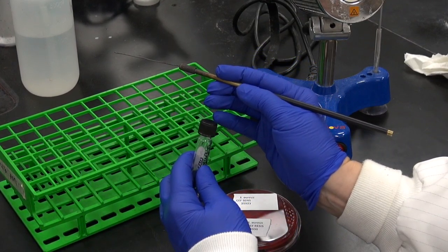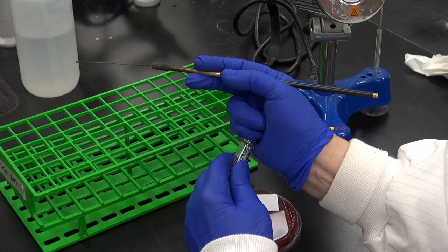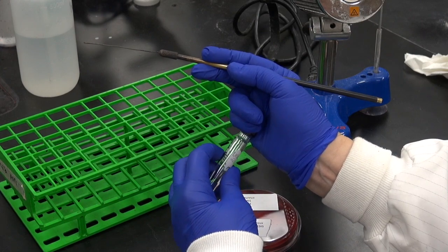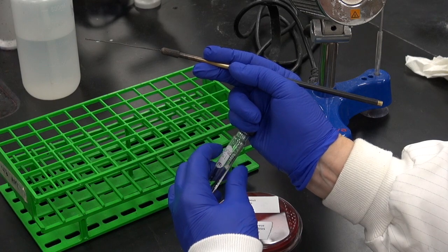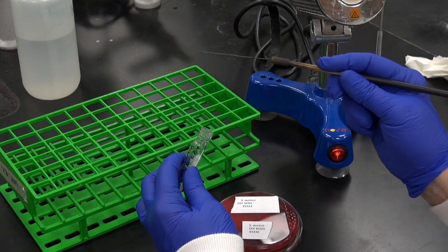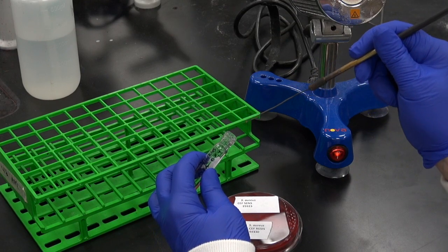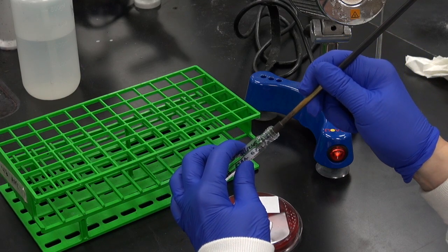Still holding the loop, remove the cap from the tube with the pinky finger of your dominant hand. Place the loop containing the bacteria from the colony you touched into the broth, trying not to touch the open edges of the tube.